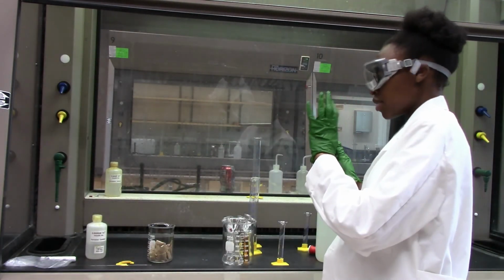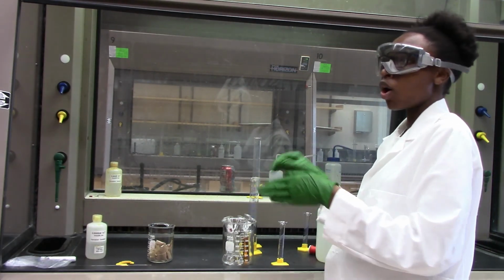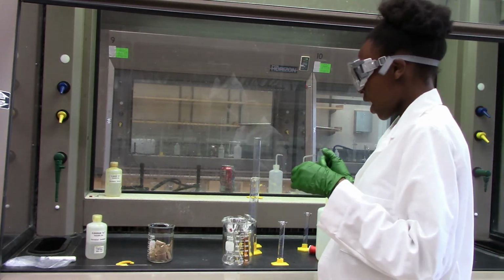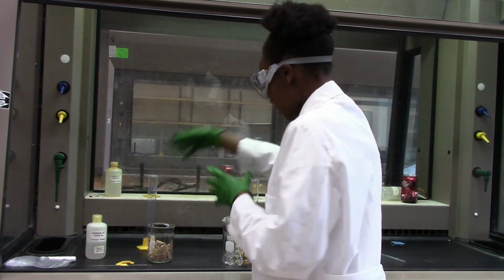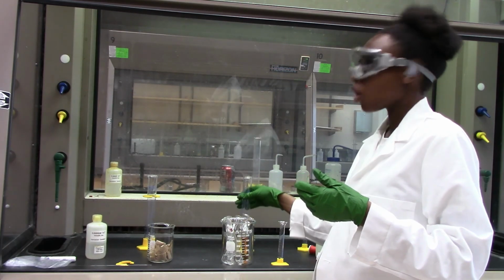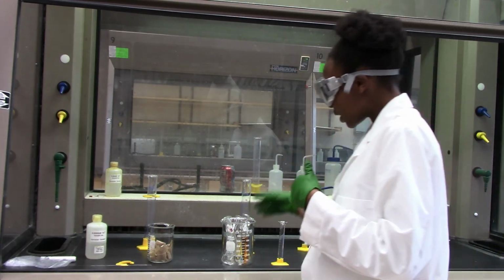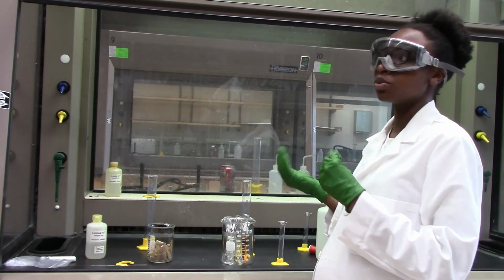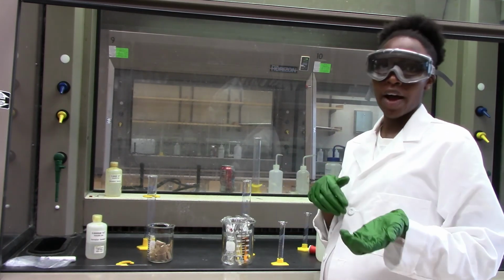I now have 5 different test tubes labeled 1 through 5, and they all have 5 milliliters of 0.002 molar iron 3. Now I am going to add to test tube 1, 1 ml of the 0.002 thiocyanate, and to test tube 2 I'll add 2, test tube 3 I'll add 3, test tube 4 I'll add 4, and test tube 5 I will add 5.